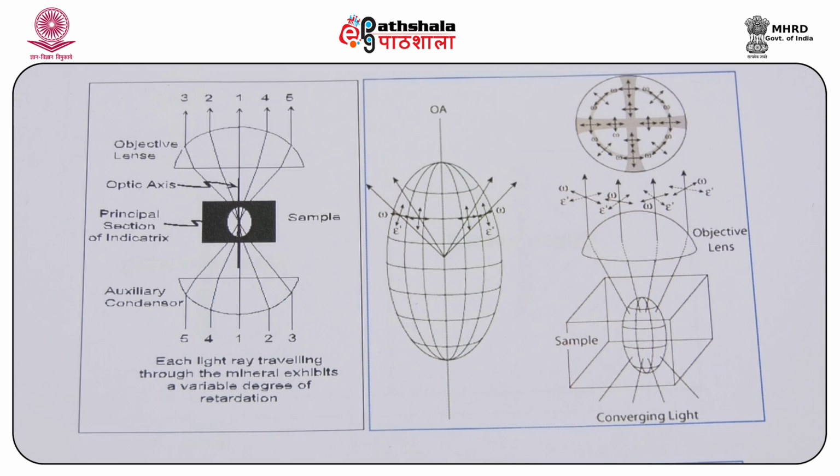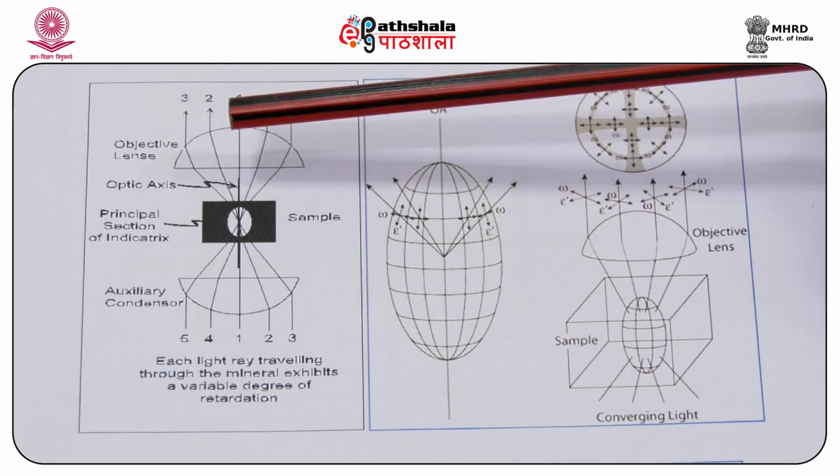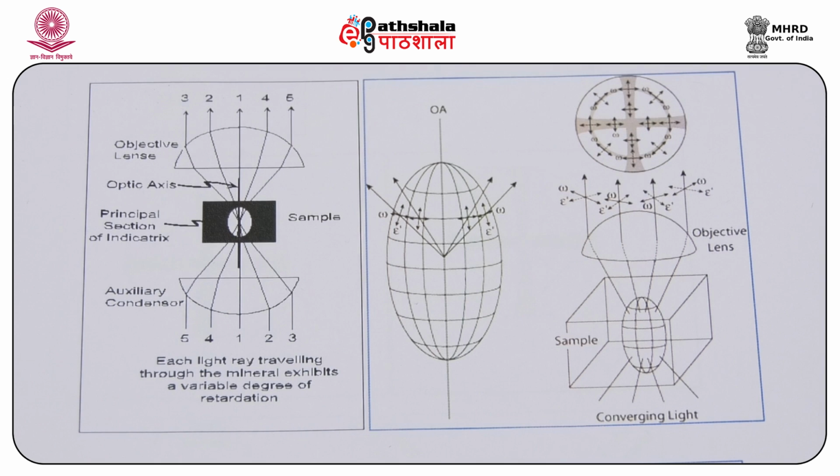But when you see light ray path 2, you will see that it is bending a bit, it has to travel an extra distance, and it comes out bent a little upward. That is, it is experiencing a moderate retardation, and likewise the ray following path 3 is at a greater angle to the optic axis, so retardation is proportionately greater.